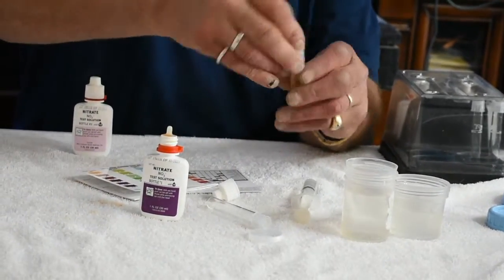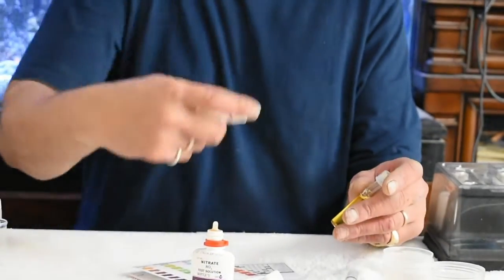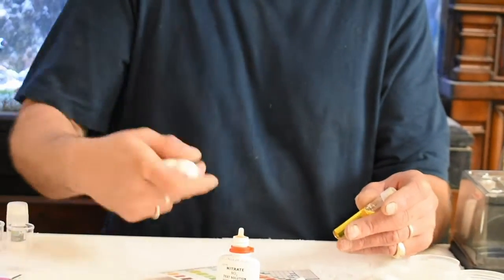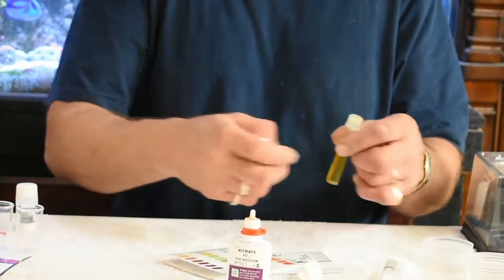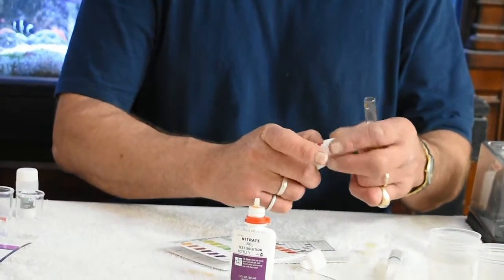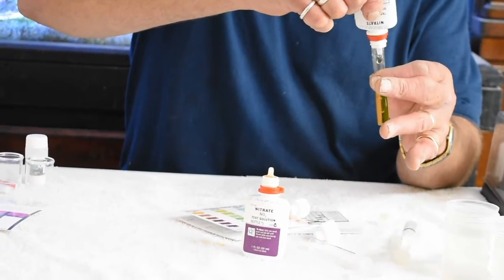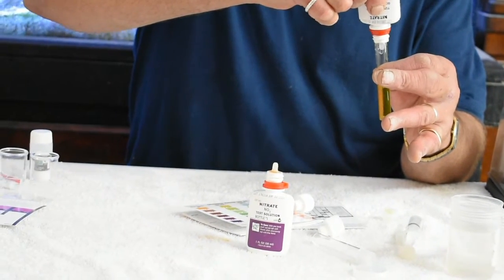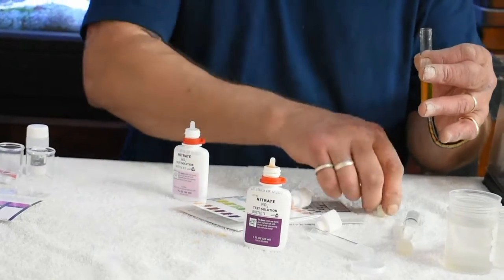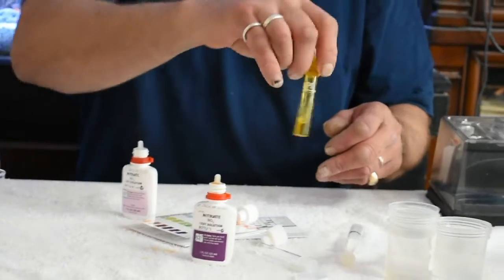Now we're going to cap that and mix that. You're supposed to shake this bottle here for thirty seconds or so. Ten more drops, and then we're supposed to mix that up really good and give it about three minutes or so.